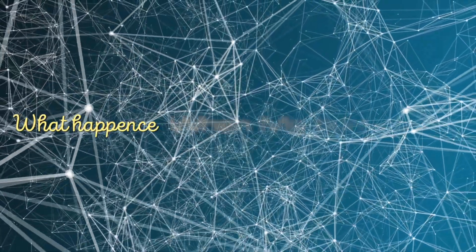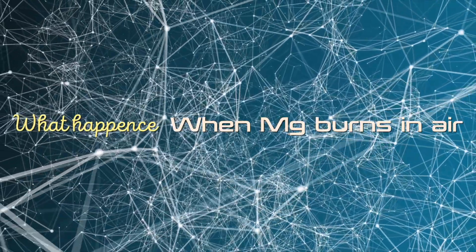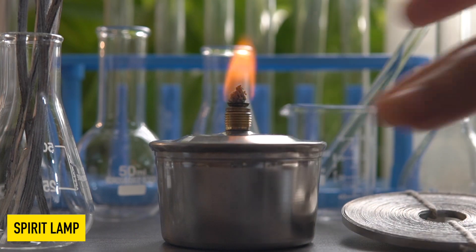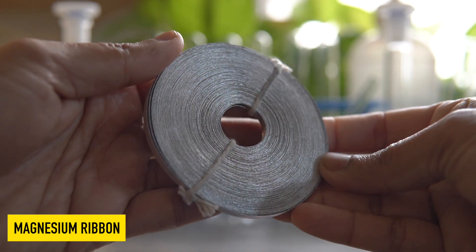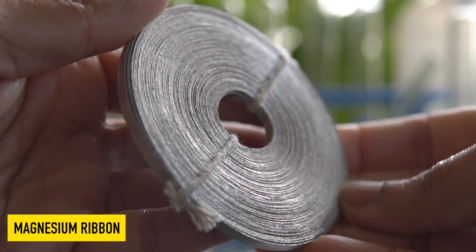Today we will see what happens when magnesium ribbon burns in air. We need a spirit lamp and magnesium ribbon. Magnesium ribbon is easily available at your local chemical shop.